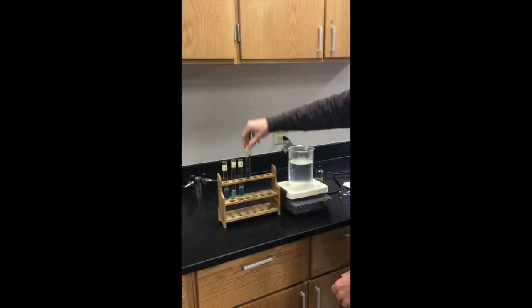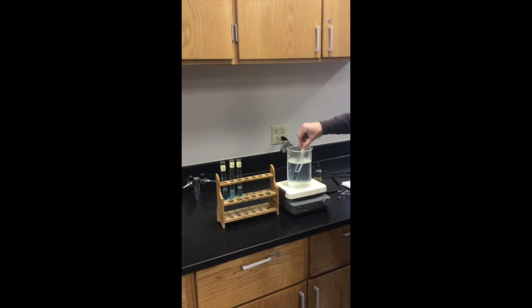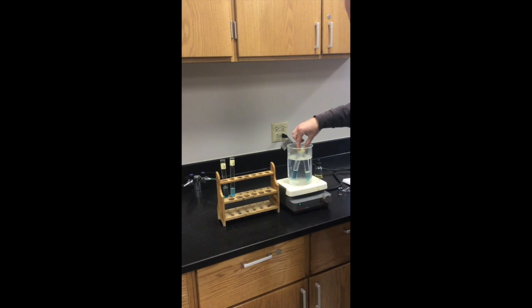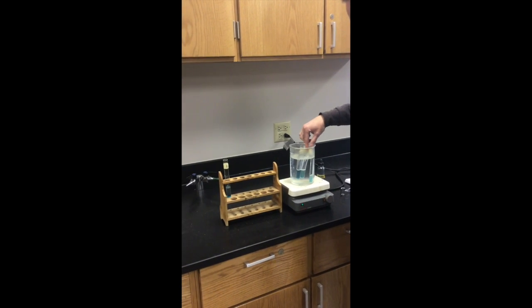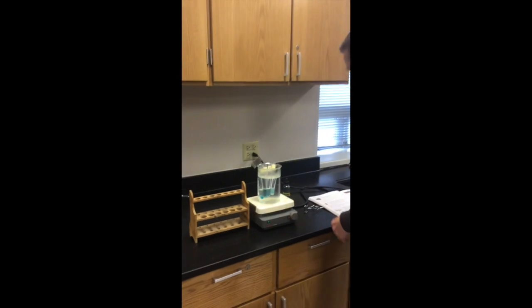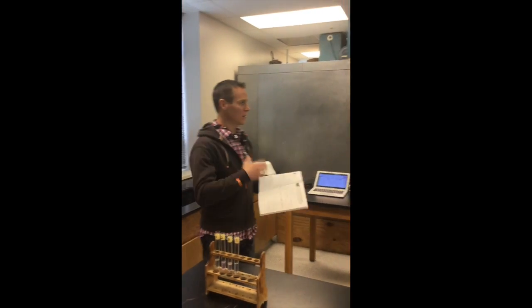I'm going to go ahead and put these in, and they will sit in here. There we go. Put this in here, get all our samples in there. And we'll have to await the results on that. We'll go back to our lipid test.